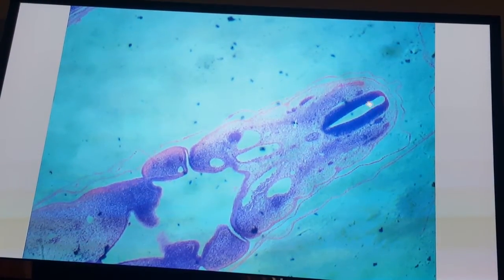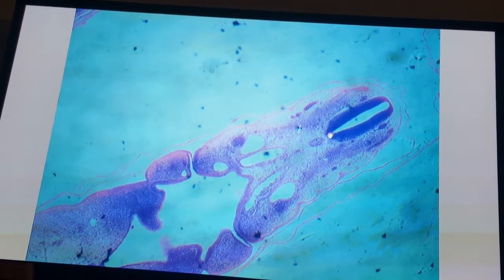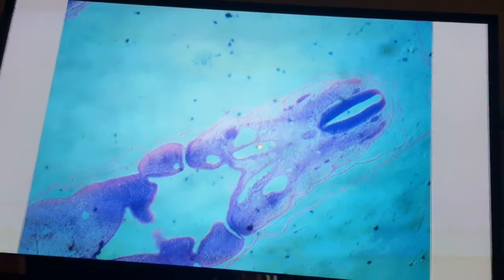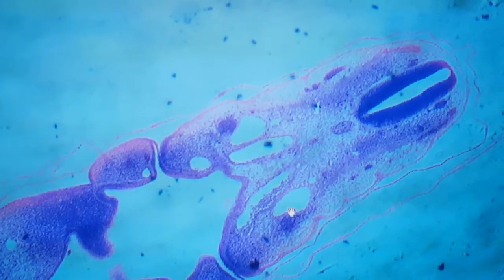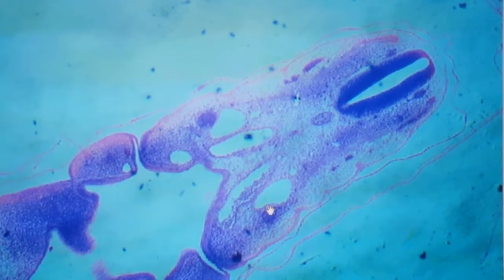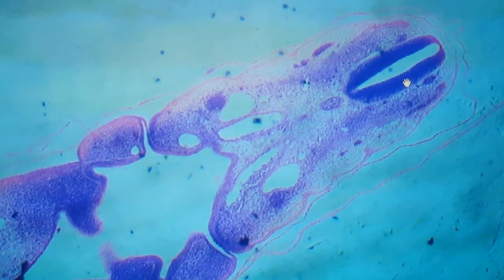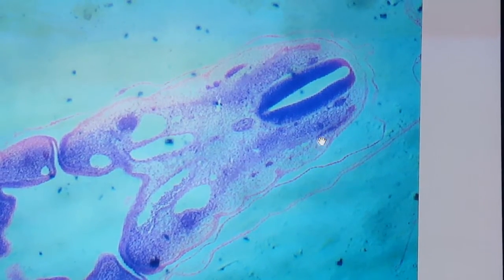The section also shows sequences. The first thing dorsally is the neural tube, which is not a spinal cord. Ventral to the neural tube is the notochord. Ventral to the notochord, here we are in the head region, so we have two dorsal aorta. Lateral to the dorsal aorta, this is cardinal vein. And of course, this is the ganglia of the 10th cranial nerve. Don't forget that on the side of the neural tube, this is the sclerotome, and that is the dermomyotome.